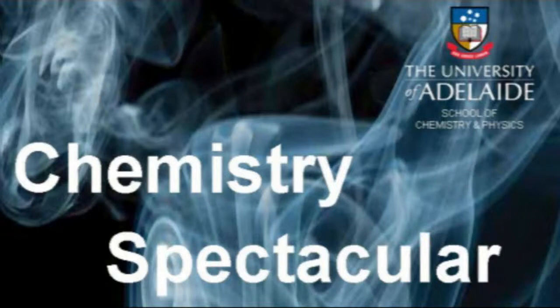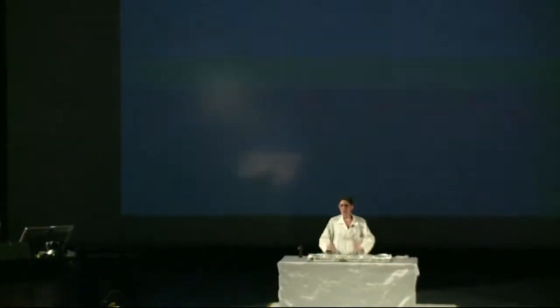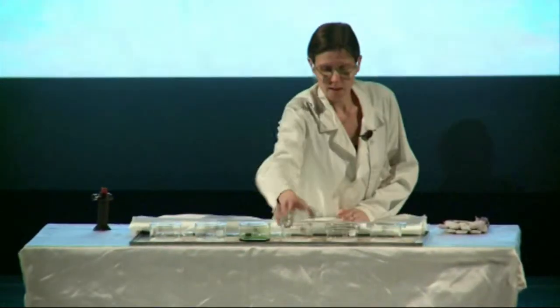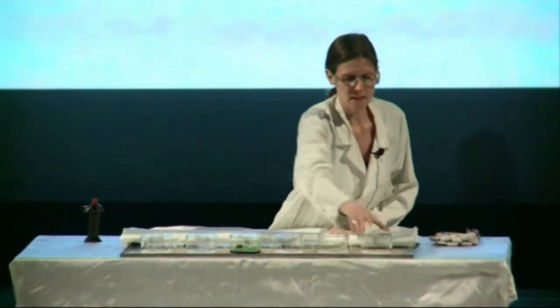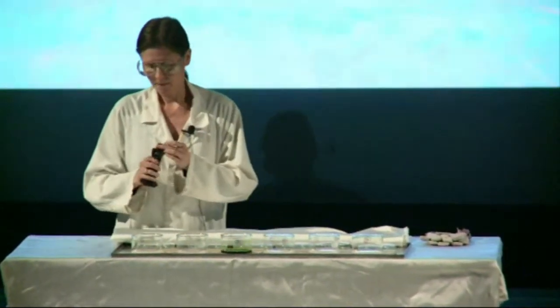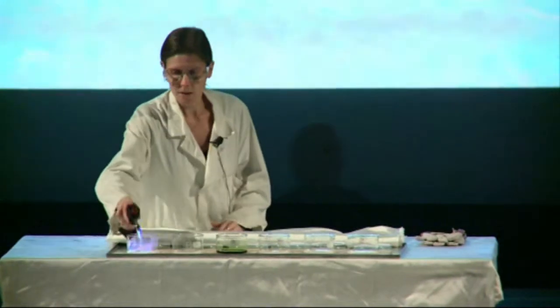The so-called alkali metals are the subject of our first demonstration, to be presented by Dr. Natalie Williamson. So as you just heard, I'm going to start things off with some metal flame colours. In each of these dishes, there's a different substance as well as a small amount of flammable solvent. And it's the solvent that I'm lighting now.